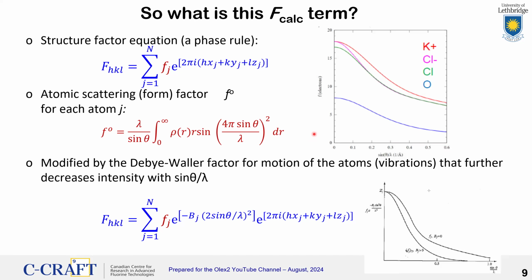Now, there's a rational explanation in crystallography why this intensity falls off with angle, because as you increase the angle, the ejected electron, which induces the X-ray re-emission photon from the L to K transition, that photon at a high angle will pass through the remaining core and valence electrons of the atom.